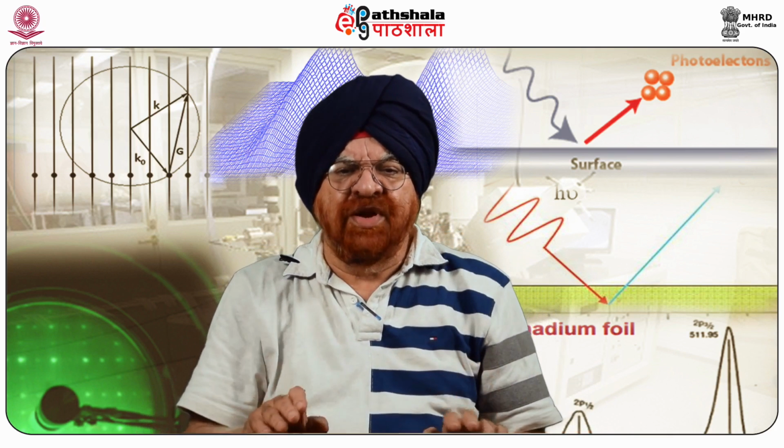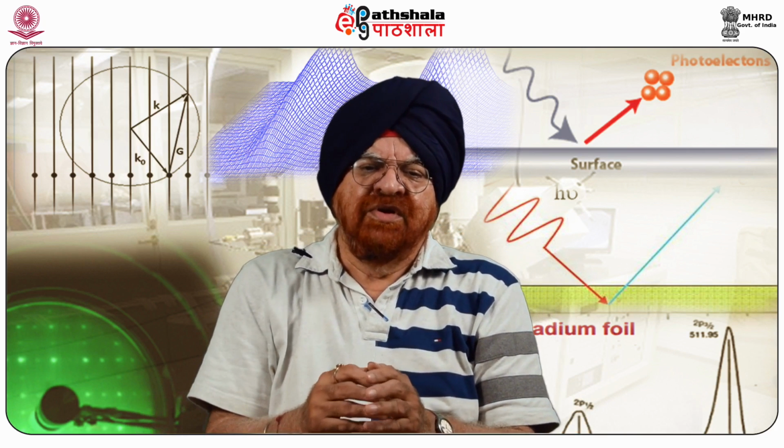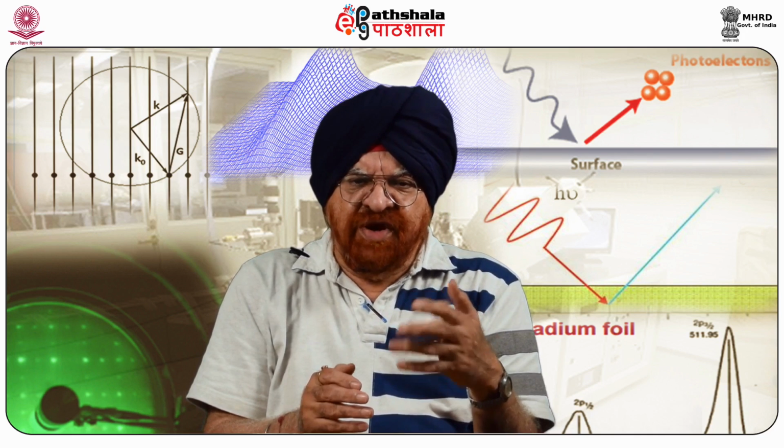The characteristic spectral peaks correspond to the electronic configuration of the electrons within the atoms, for example 1s, 2s, 3p, 4s, 3d, etc., and can be very clearly checked and deciphered with the help of this spectroscopy.